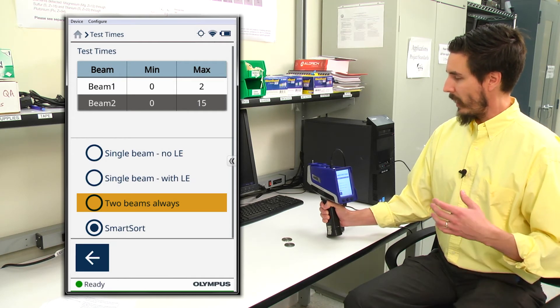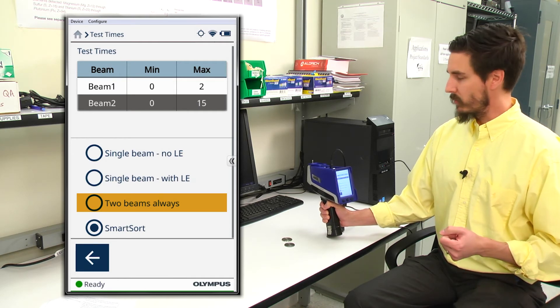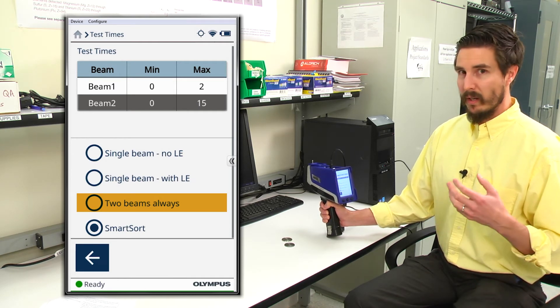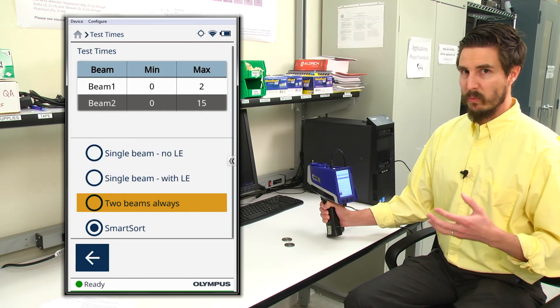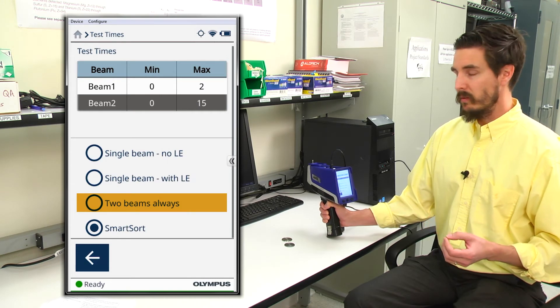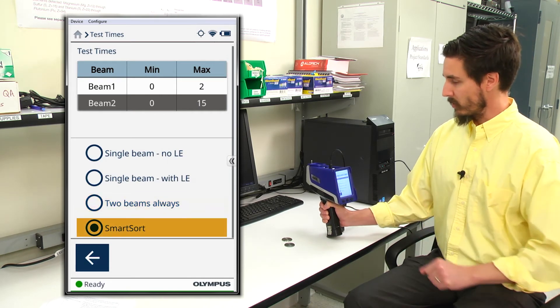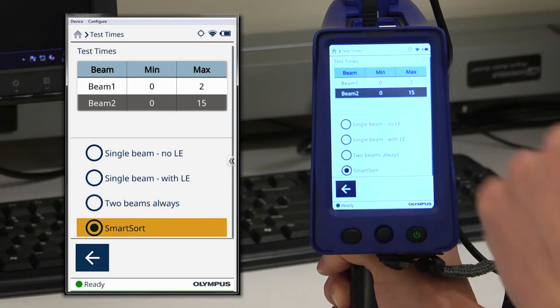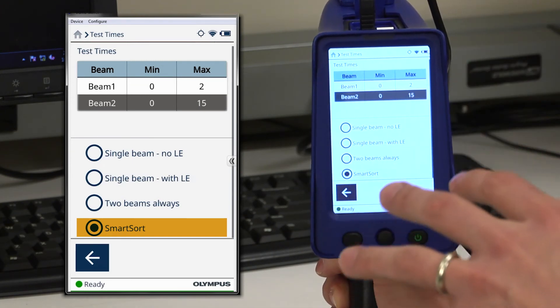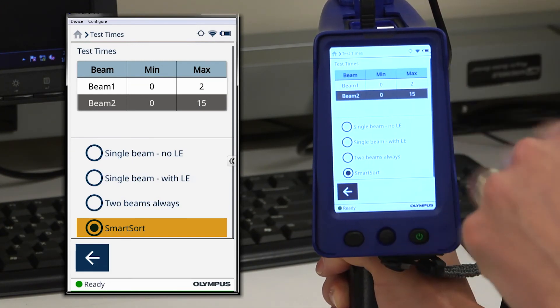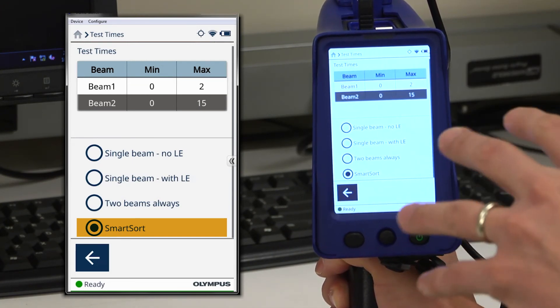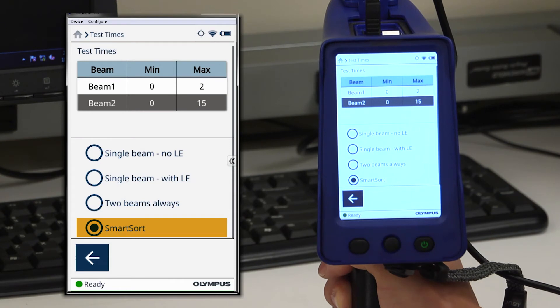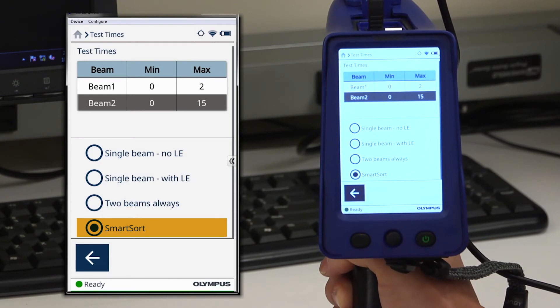However, a rapid way of doing alloy sorting with as much information as we can provide the instrument is to use smartsort. By using smartsort, we allow the analyzer to make the choice of whether or not to use beam two in its analysis.